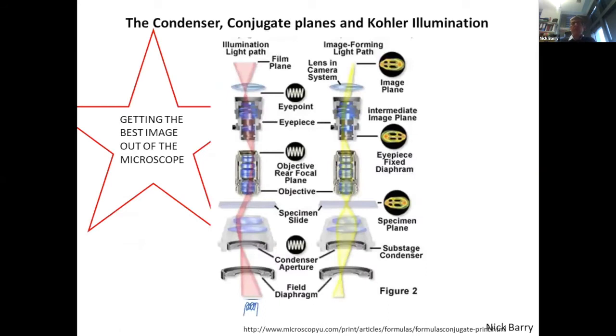But if we look at all the components of a typical microscope together, you realize that there's a considerable complexity in them. We have some sort of white light source, let's say, a condenser optics for illuminating the sample, the actual specimen itself on a slide, and then the objective and an eyepiece, and then this lens here represents the lens of your eyeball, ideally forming an image on the back of your eye.